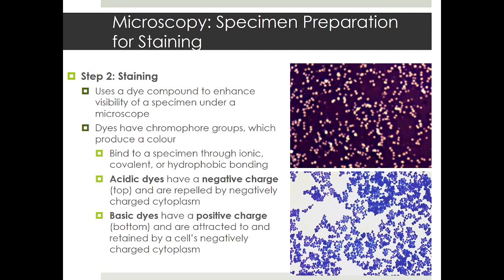Whereas if you do a simple stain, you have to heat fix. So that's a differential that you can choose between as well when you're trying to decide what you would like to do with your samples. You view it for whatever reason, right? When you're designing an experiment or a research study, you get to pick and choose what types of procedures you would like to use. And these are some things that you can think about.